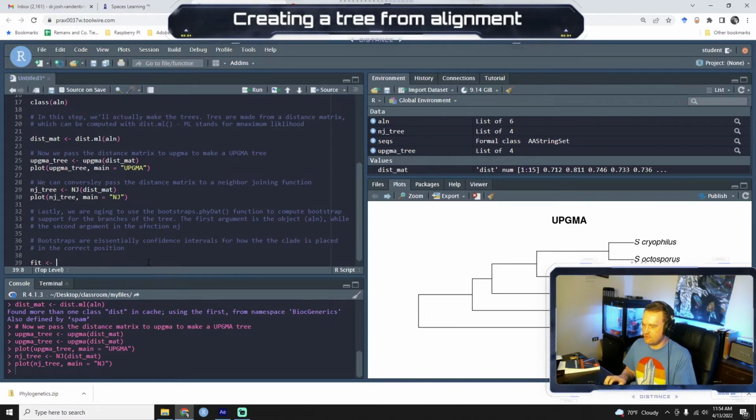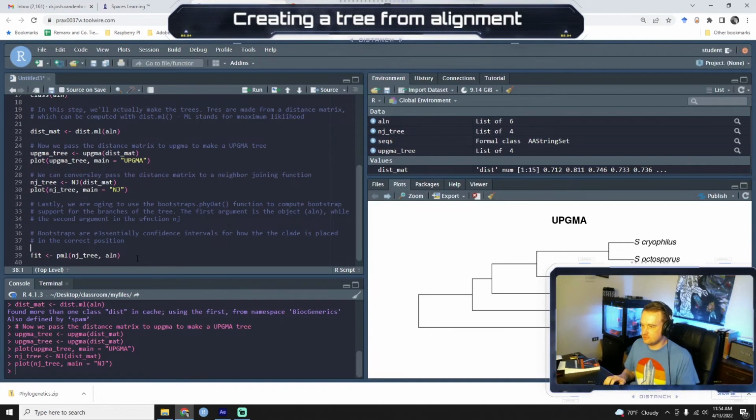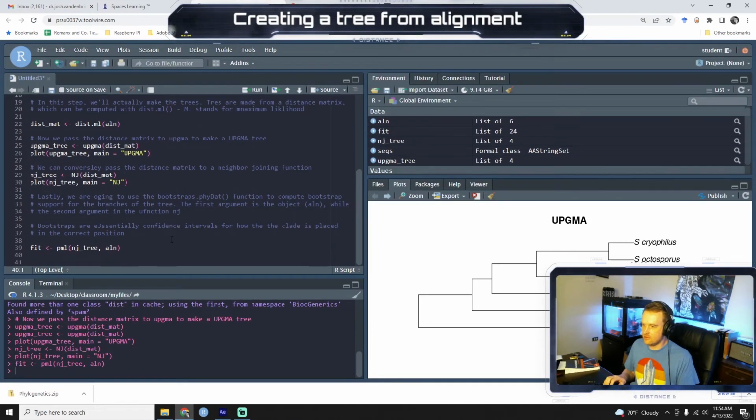All right, so first we're going to do fit PML NJ tree ALN. So we're going to run that.